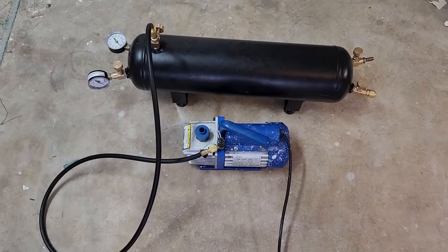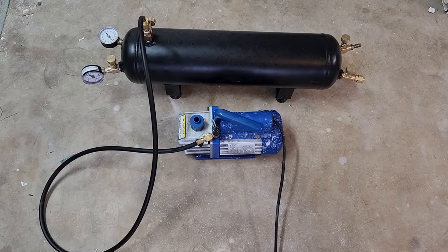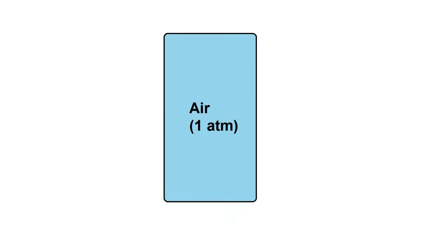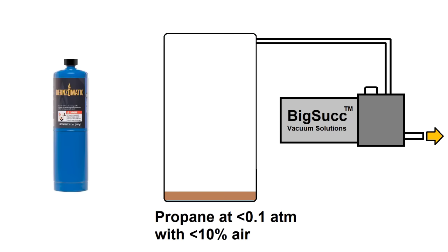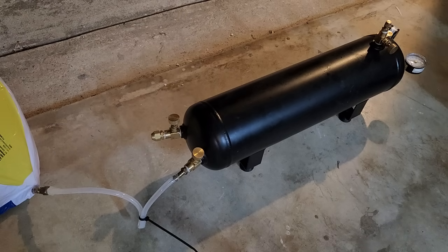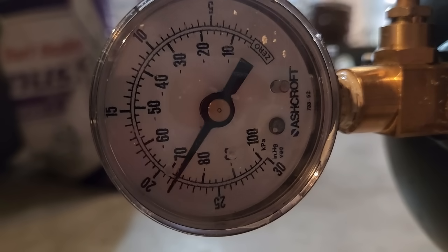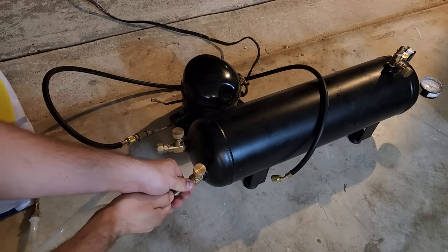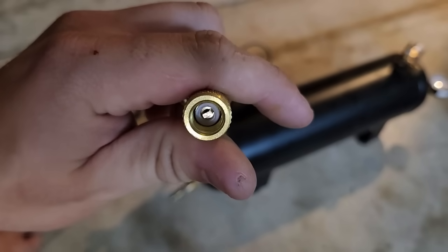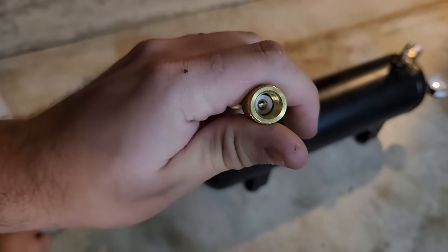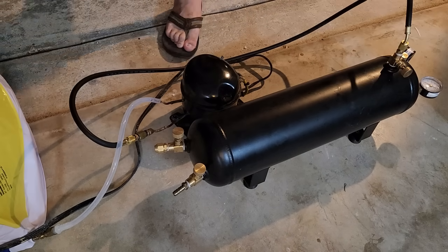To store the ethylene, I got this 2.5 gallon or 9.5 liter air tank that I added pressure and vacuum gauges to, along with several different fitting types with shutoff valves. To make sure there won't be an explosive mixture, I evacuate the tank, then flood it with propane, then evacuate it again. This ensures that any residual gas left in the tank is almost entirely propane, which will play nice with the ethylene. I initially hook up the beach ball directly to the tank since it's under vacuum and crack the valve open to let the ethylene gas in. Then to put the rest in under pressure, I connect the beach ball to the inlet of a fridge compressor and run it for a minute or two to purge any air out of the hoses. Once I can smell the ethylene coming out of the fill hose, I hook it up to the tank.